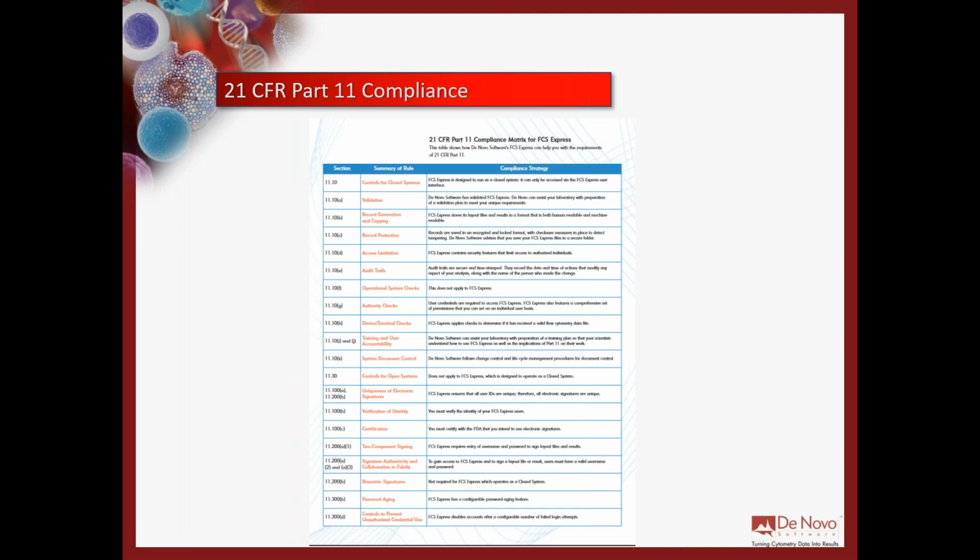Not only do you know that the gate was moved, you know exactly what coordinate it was moved from, and you know what coordinate it was moved to. Not only do you know the data file on the plot changed, you know what data file it changed from, what data file it changed to, at what time, by what user. Our permission system to support the 21 CFR Part 11 functionality has over 400 or 500 granular permissions where you can create whatever groups you want, and you can assign different people to those groups. It's a completely flexible electronic signature system where you can create as many different signatures as you like per document, and you can set rules which of these arbitrary security groups that you've made can sign those particular signatures, and under what criteria they can be signed.